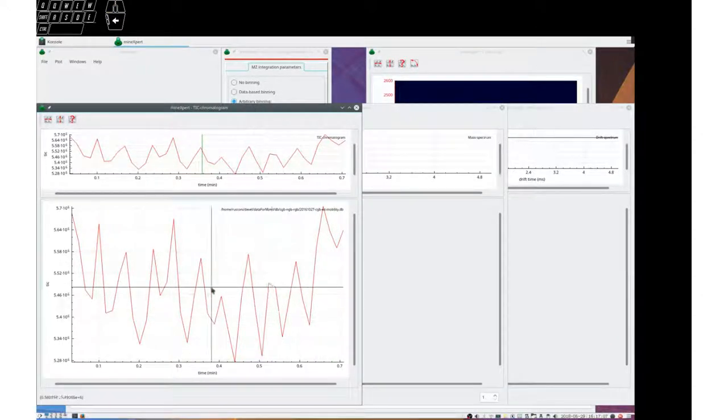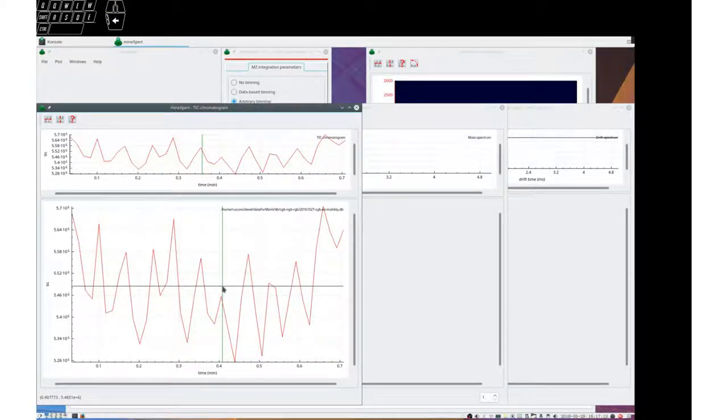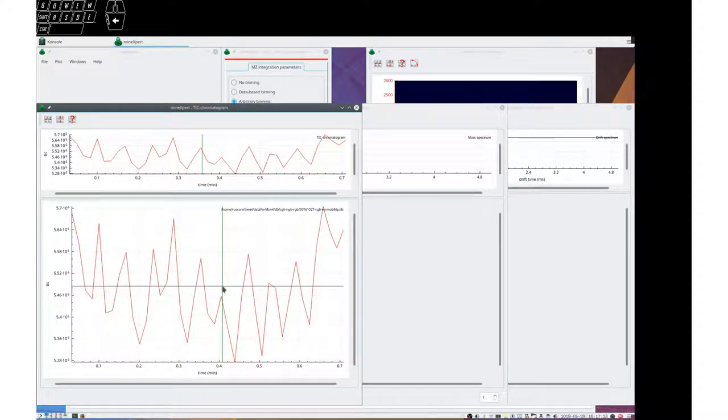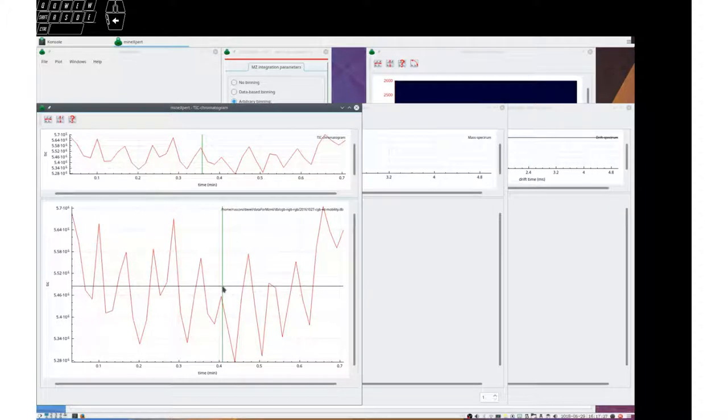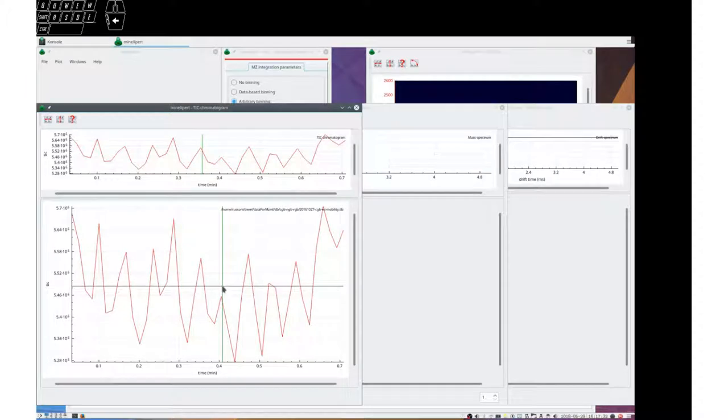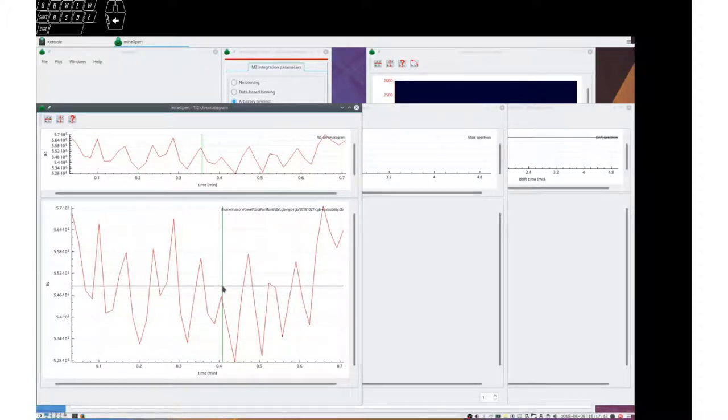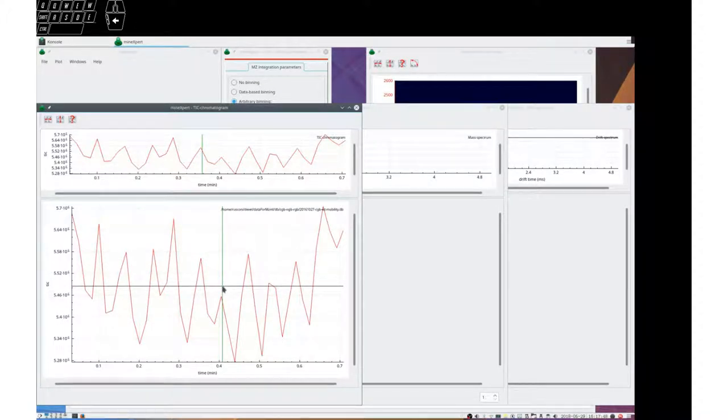Greetings everybody. This tutorial is about mass data navigation in MineExpert. Being able to easily and intuitively navigate in mass data is the basis for ease of data mining in mass spectrometry. In this tutorial we'll see how to navigate data, be that data a mass spectrum, a chromatogram, a drift spectrum, or a color map.